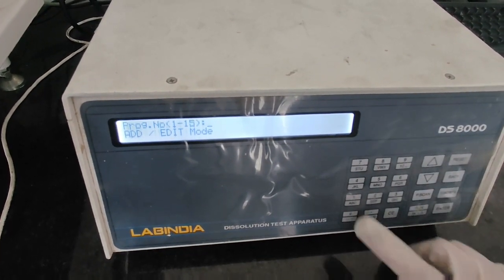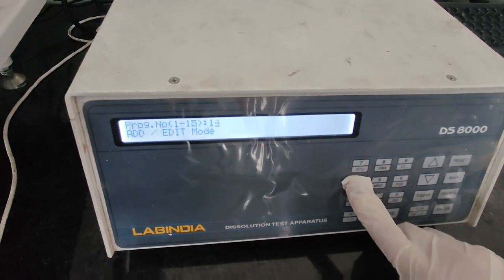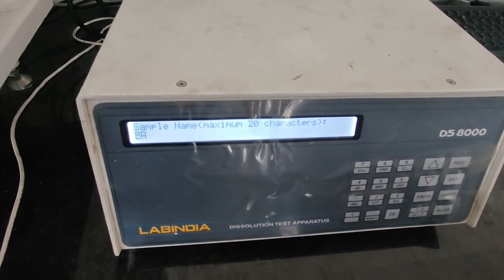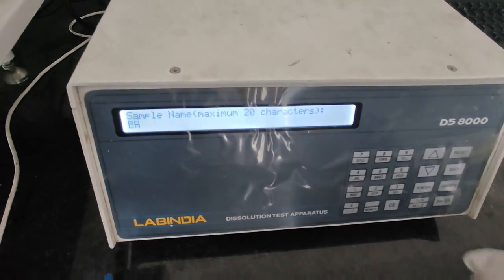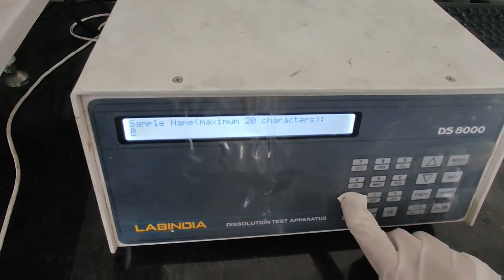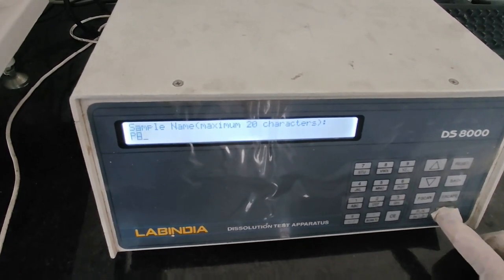We will give the program number. For example, I am giving number 14. Then again press enter. Then give program name. For say, I am doing dissolution of paracetamol tablets, so I will give P and A.